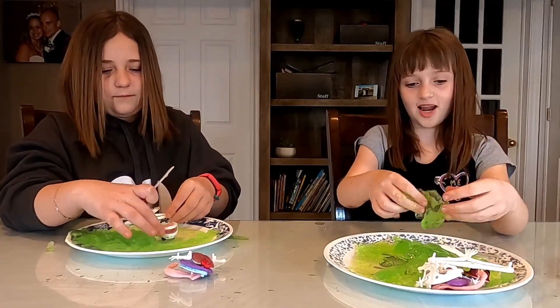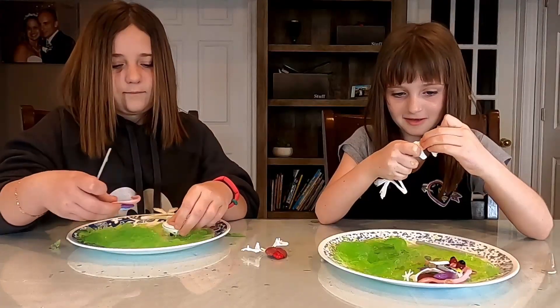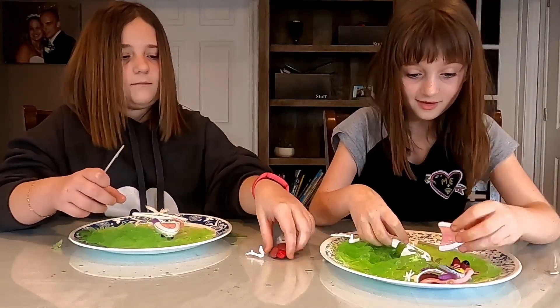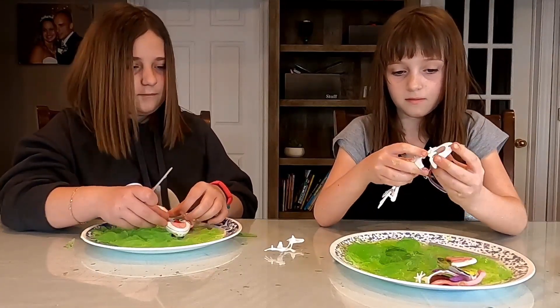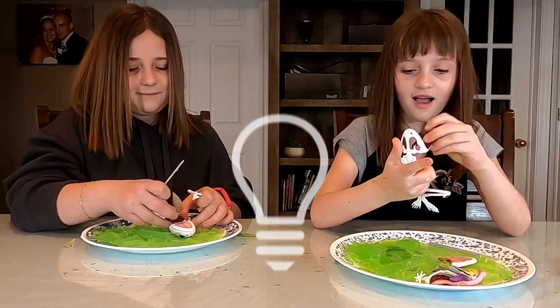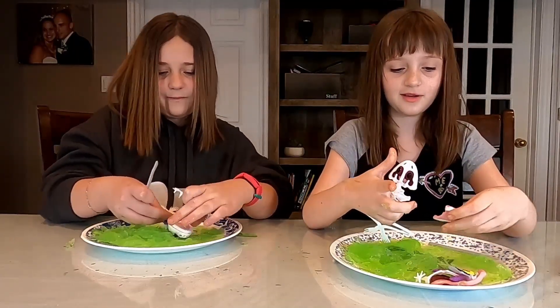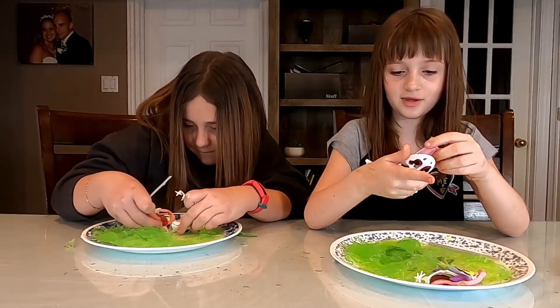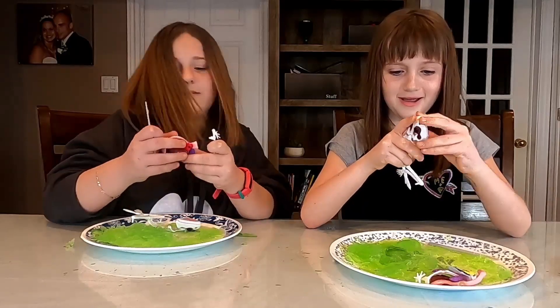Now you have to put that back together faster than your sister to win this challenge. A little confusing? A lot. Now Alyssa was being smart — while she was dissecting she was putting the body parts together so she knew how to put it back together. Good job Alyssa, that was really good. I should have done that. I feel unsmartened now.